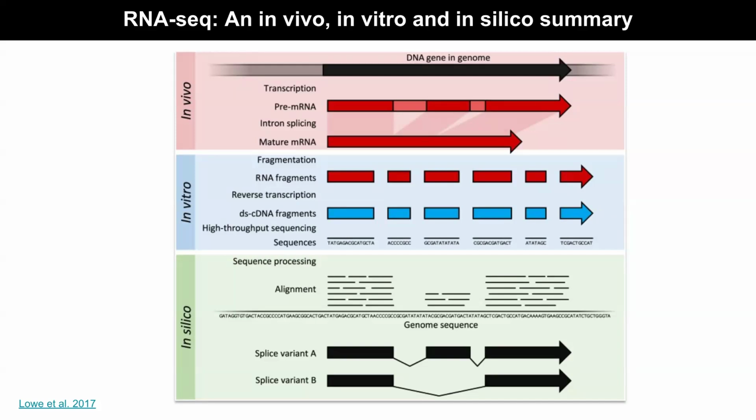Okay, very good question again. So it does matter to some extent. It doesn't show up here, but it will start to, and we will have to feature that part in when we start talking about it. Very good point, right? So think about this as a length problem. If I were to sequence this DNA, this is DNA1, and this is DNA2, and I put this on the flow cell, right?